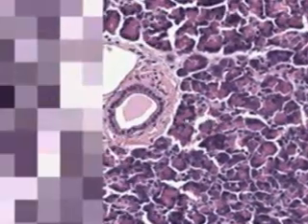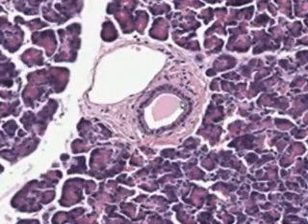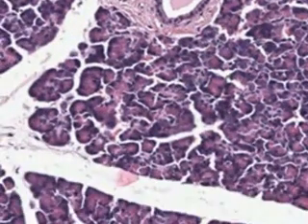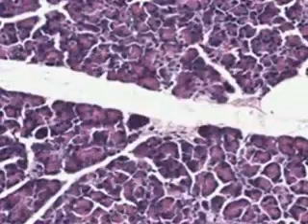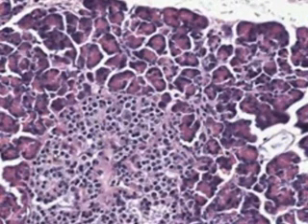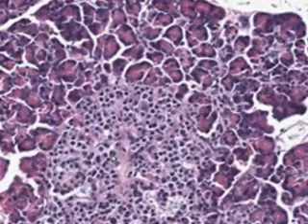Notice within the lobule you may find an actual duct. Well, to tell you the truth, I think this might be an intralobular duct, but I'm a little concerned with the amount of connective tissue around it, so it could be kind of extralobular. We should have no trouble finding a nice, well-defined interlobular duct. Here is an islet, and don't bang your head against the wall. You really cannot differentiate on regular H&E microscopy alpha cells from beta cells. So just call these islet and just call these islet cells.